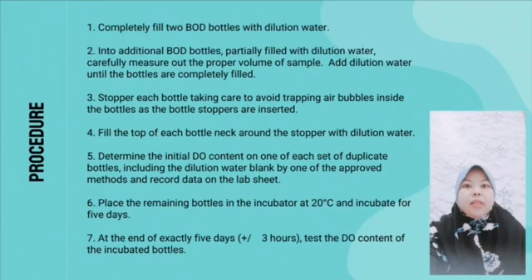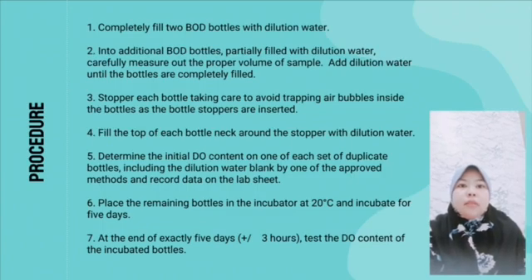I, Jorina binti Kasim, will continue with the BOD treatment procedure. First, completely fill 2 BOD bottles with dilution water. Second, in 2 additional BOD bottles, partially fill with dilution water. Carefully measure out the proper volume of sample.